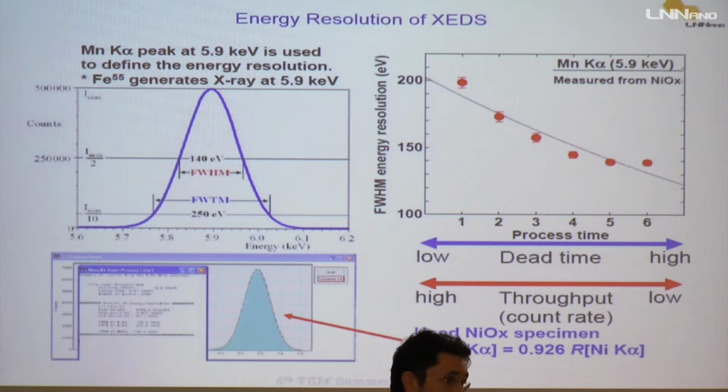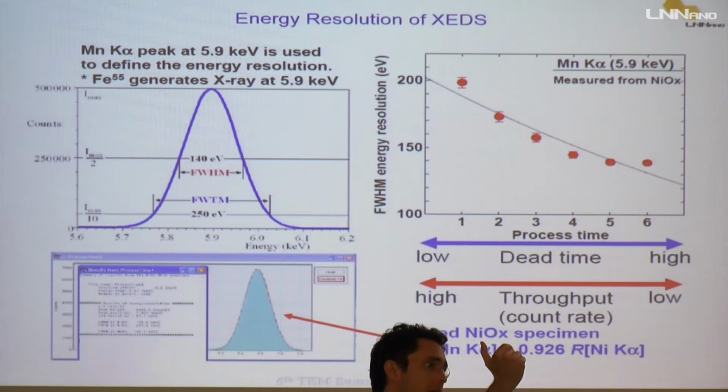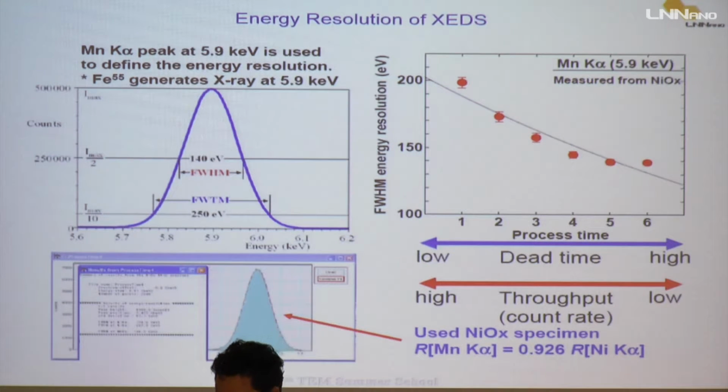It will generate many photons, and then it may saturate your detector and make the dead time too high, okay? Or you can work in a situation with a smaller dead time to make your detector work in a correct way.